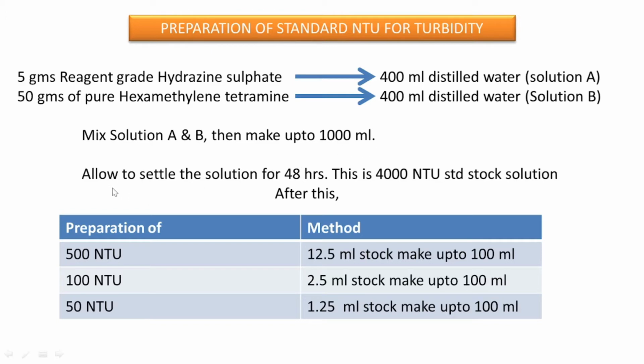And after that we need to keep it for 48 hours to settle. That prepared solution is the 4000 NTU standard stock solution.